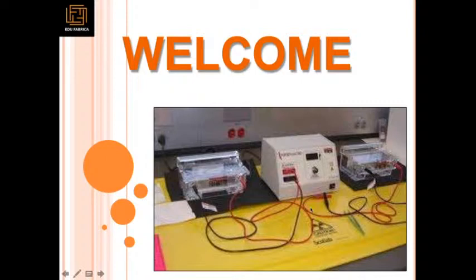Gel electrophoresis. So in this part, I will be dealing with various types of electrophoresis, its types, and what the advantages and disadvantages are, what the applications are, which one is widely used. So all these things will be covered in this part.